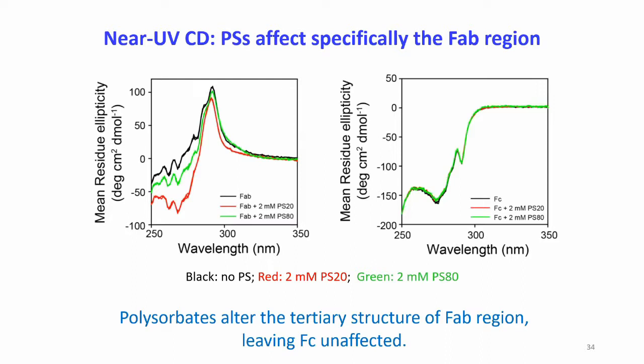But if we have enough sample, like the way we have shown in the case of heat shock protein binding to its ligand ATP, one can really use the near UV CD data to monitor the binding constant KD. But since we were limited by the antibody samples from Pfizer, we were not able to do the complete binding curve.